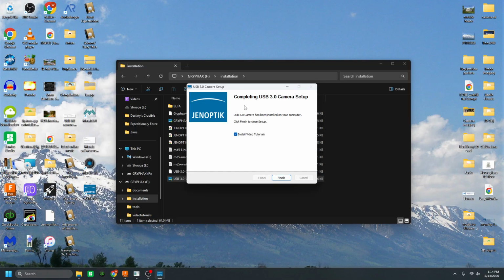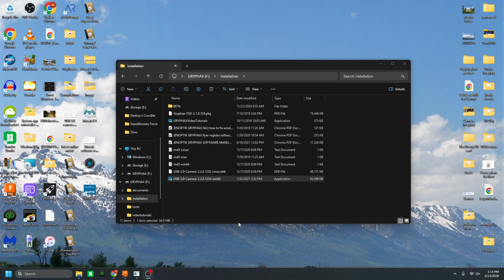Okay, and now it's going to ask if we want to install the video tutorials. If you're a new user or not familiar with the product, I would absolutely suggest you do this, but since I've had them before and I've seen them, I'm going to go ahead and uncheck that. And we're going to finish the installation. So now we have our GRYPHAX software package right here, and we're going to double click to launch to make sure all that works.